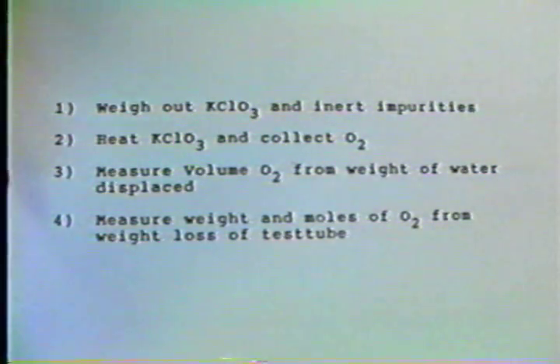And finally, of course, the measured weight loss in the test tube will be equal to the weight of oxygen generated, which we can, using the molecular weight, convert to the moles of oxygen generated. Well, let's see what the experimental setup looks like.